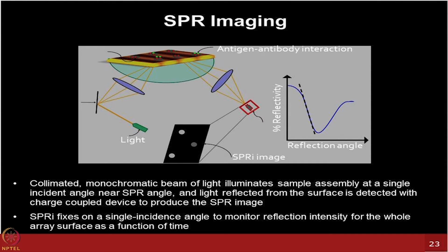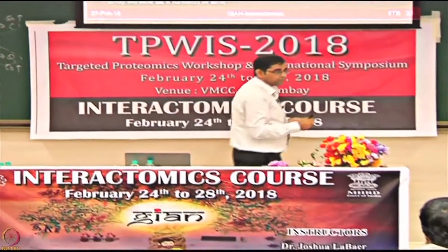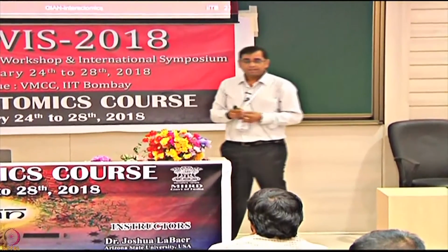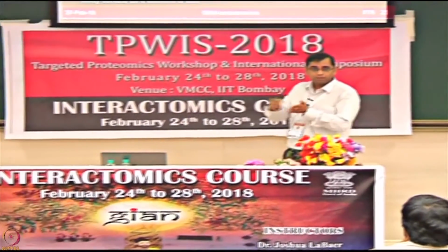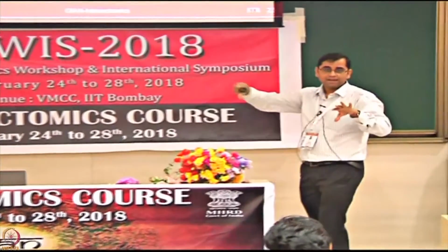And that's where you have to play with the conditions to find out what can be that best angle which can be fixed for the whole chip surface to do those kinds of assays. Once you find that, and again that may not be the best and most accurate angle, let us say 19 you have decided or 20 you have decided, you may have to play with more to find out what can be the best angle to freeze for the whole chip to be scanned.